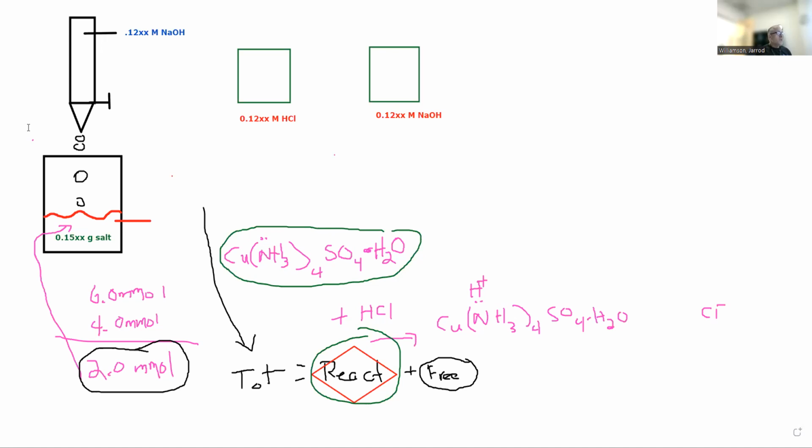You have to calculate and determine the actual values of these next two decimal places. You do this one by titrating it against KHP solid. You've done this before. And then you will titrate this hydrochloric acid against that separately.